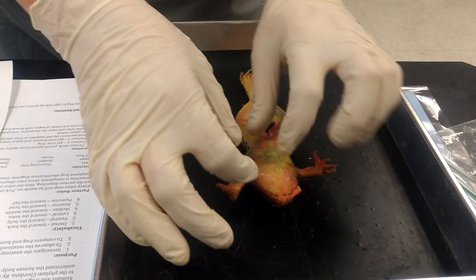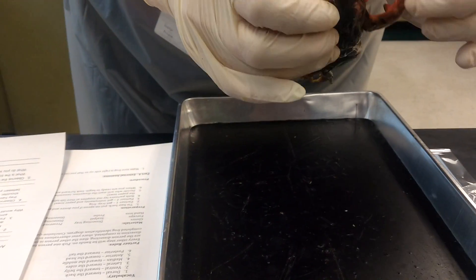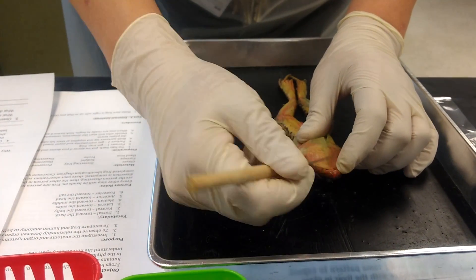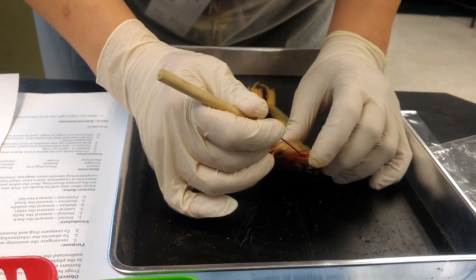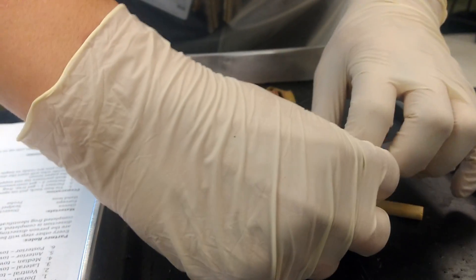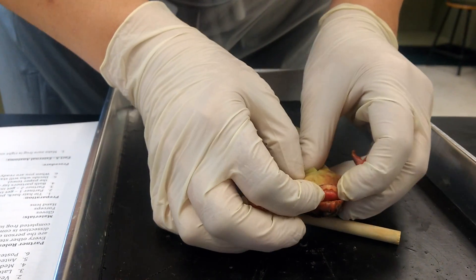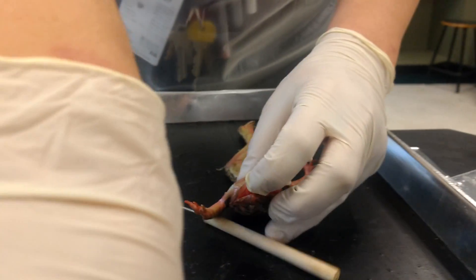Next we're going to open up the jaw — this is going to be more than a little bit difficult. Get your probe in there — use the probe, not the scalpel — and just open up the jaw. It's going to be stiff because it's dead and has gone through rigor mortis. You can palpate inside the jaw and look around — yes, there is a tongue in there.